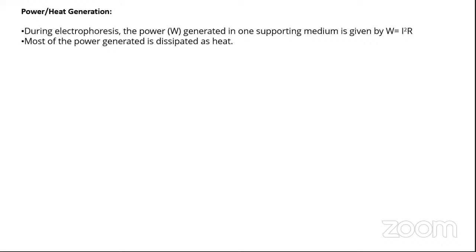What we are trying to do here is make the molecules of our interest migrate under the effect of an electric field and give us a good separation. That's the entire purpose. Now, whatever is happening, heat is getting generated due to increased voltage, and because of heat increase, you will get increased mobility because of the drop in viscosity. That's our anticipation. But actually, it doesn't happen like that.